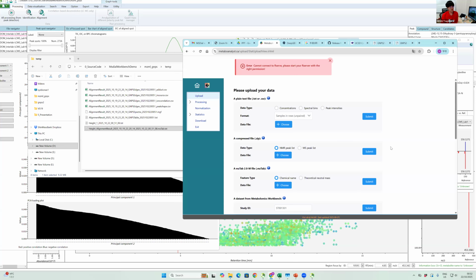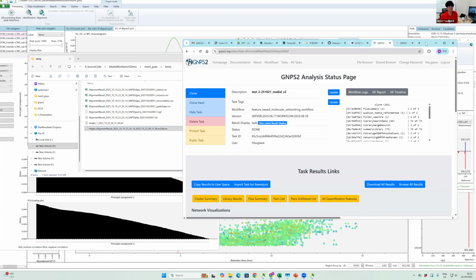I cannot connect to the server. I could actually process this mzTab-M 3 hours ago, but maybe there is a server issue currently at the site of MetaboAnalyst, unfortunately. But anyway, you can import this MS-DIAL mzTab-M file to be used in MetaboAnalyst.